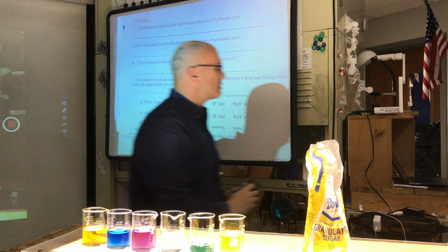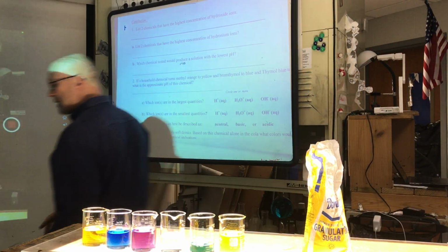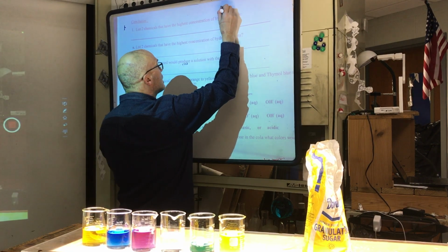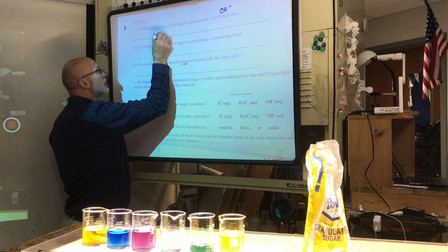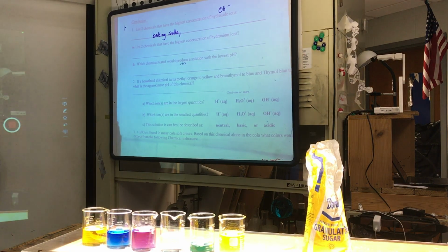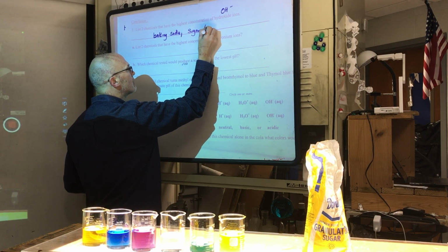So based on this, list the two chemicals out of the four that had the highest amount of hydroxides. Hydroxides are the OH minus. The most basic. Basic means hydroxide. So who had the highest pH? Baking soda. And then what was the next highest? Sugar, water, right? So, sugar. Now we would say it's really the water, but you get the idea.